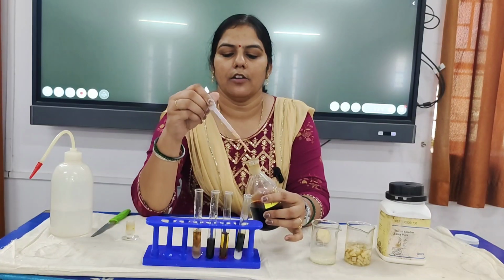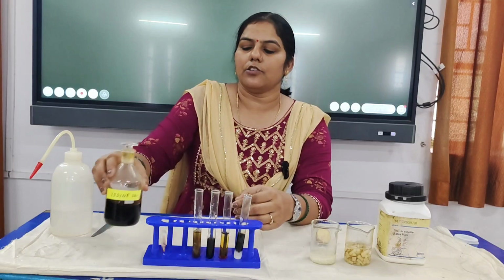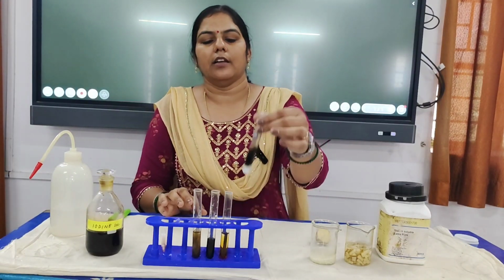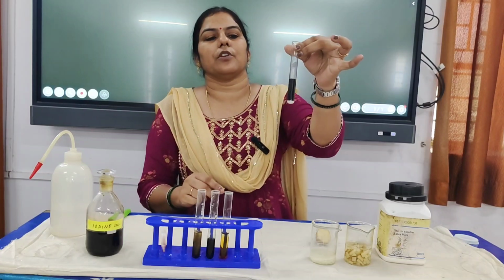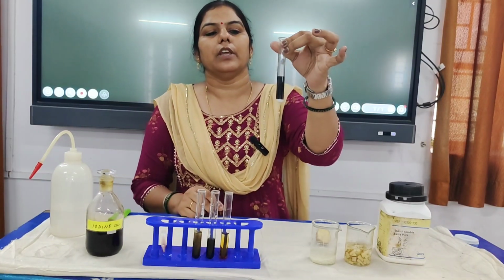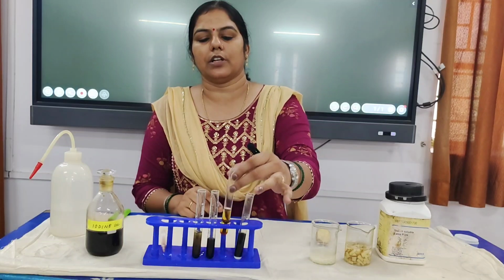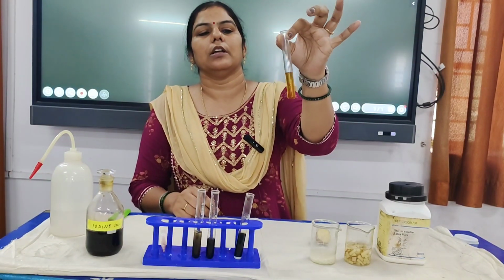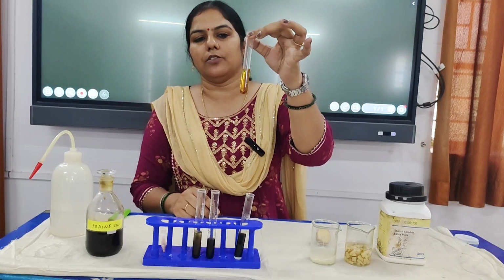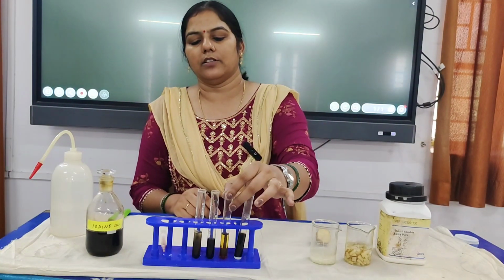I have added 5 drops of iodine solution in each of the test tubes, and as we can see, in the starch solution, which was serving as a positive control, we can observe the blue-black color of the iodine solution. Now this was our negative control, meaning water. Here no starch is present, so the color is not blue-black, it is slightly orangish.